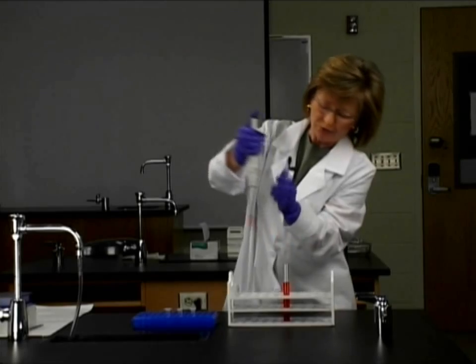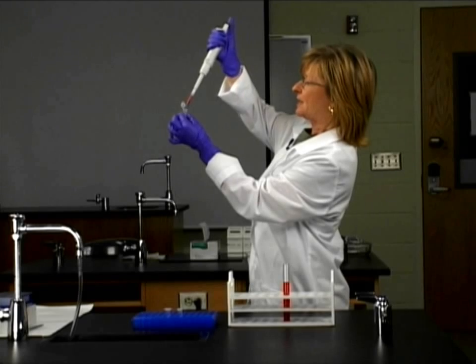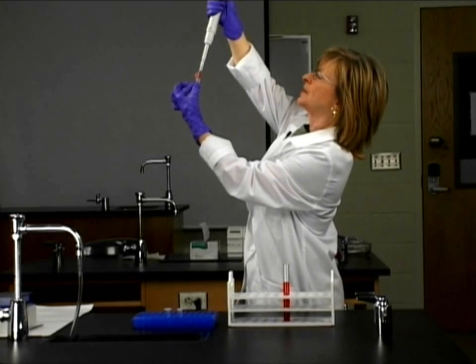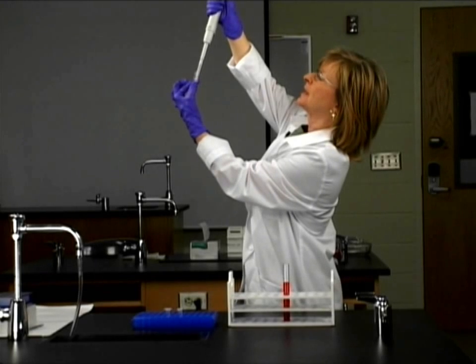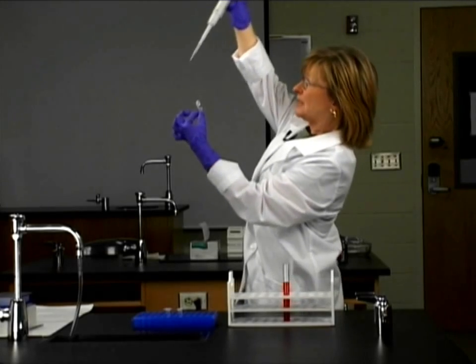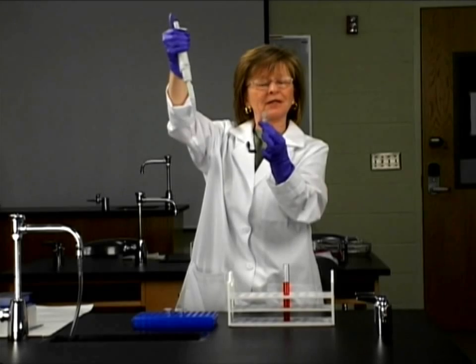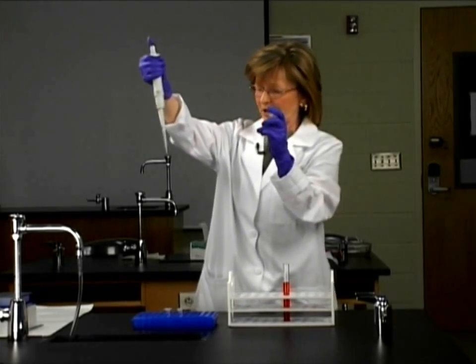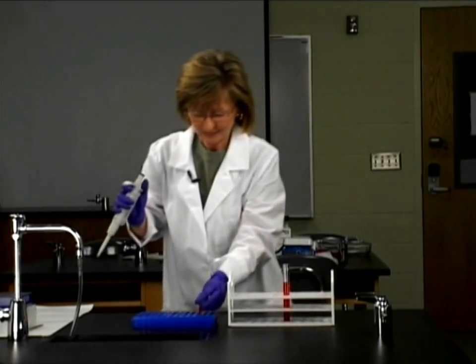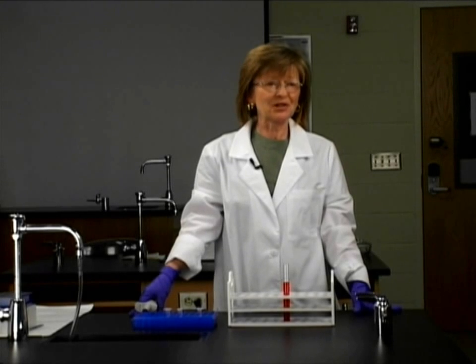Then we're going to pick up our one-and-a-half mil tube and at eye level, we're going to slowly expel to the first stop and then to the second stop. Then we release the barrel after we've taken the micropipet tip out of the solution. So that's basically how you perform micropipetting. It's not difficult, but it does require technique, and it does take practice.